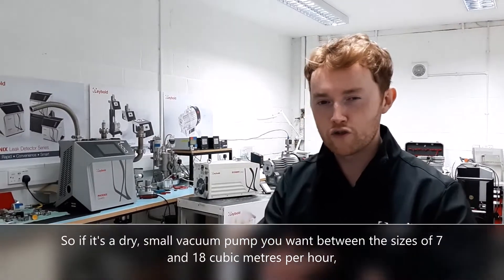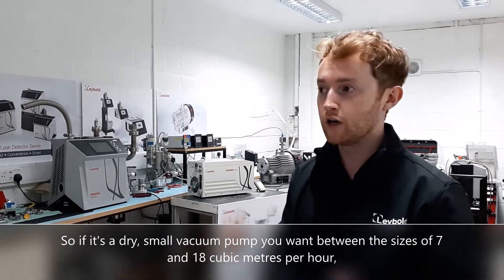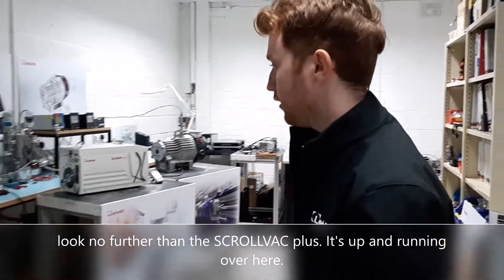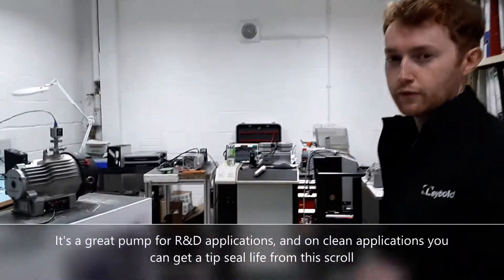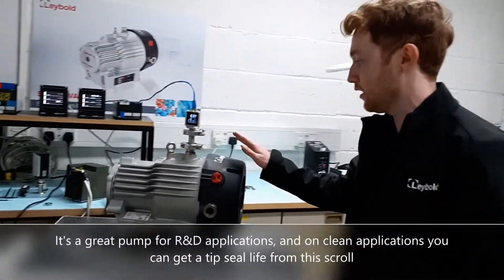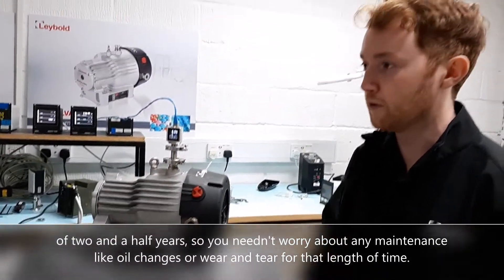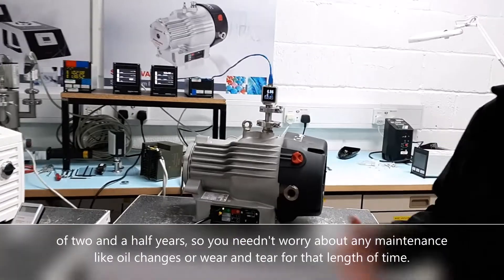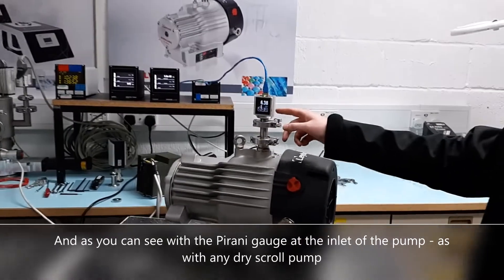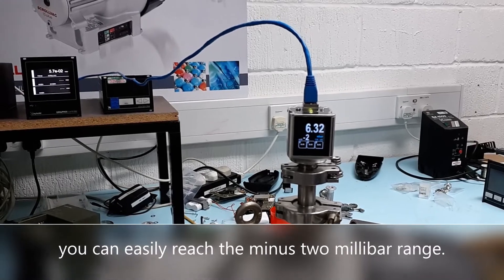If it's a dry small vacuum pump you want, between the sizes of 7 and 18 cubic metres per hour, look no further than the Scroll Vac Plus. It's up and running over here. It's a great pump for R&D applications, and on clean applications you can get a tip seal life from this scroll of two and a half years. So you needn't worry about any maintenance like oil changes and wear and tear for that length of time. And as you can see with the Pirani gauge at the inlet of the pump, as with any dry scroll pump you can easily reach the minus 2 millibar range.